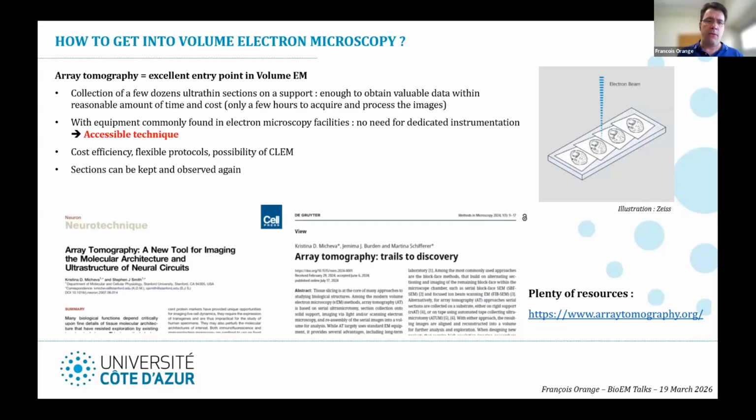Array tomography allows flexible protocols, the possibility to do correlative light and electron microscopy, and also sections can be kept and observed again. At the bottom of this slide, I just mentioned 2 papers. The first one, by Kristina Micheva, who created the term array tomography back in 2007, the paper on the left, to describe the technique.